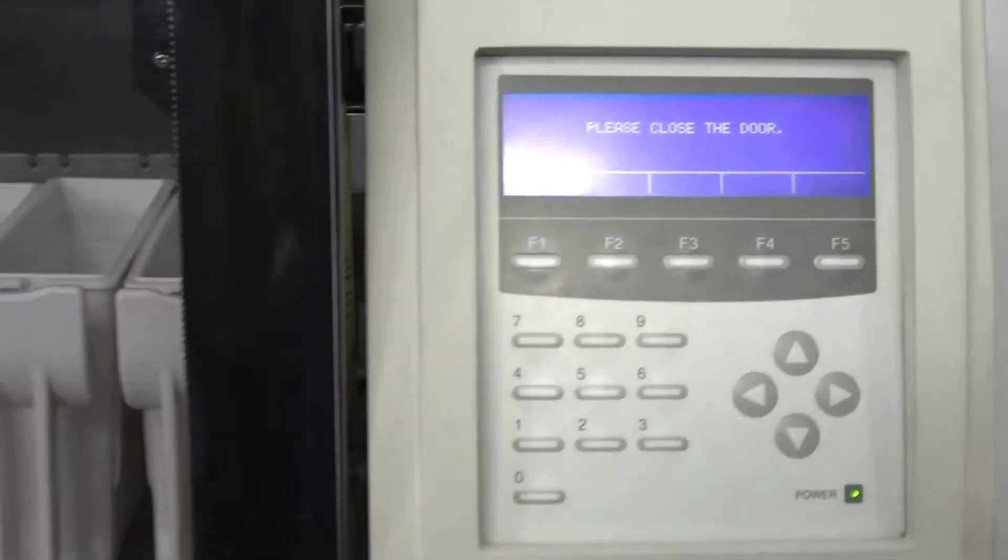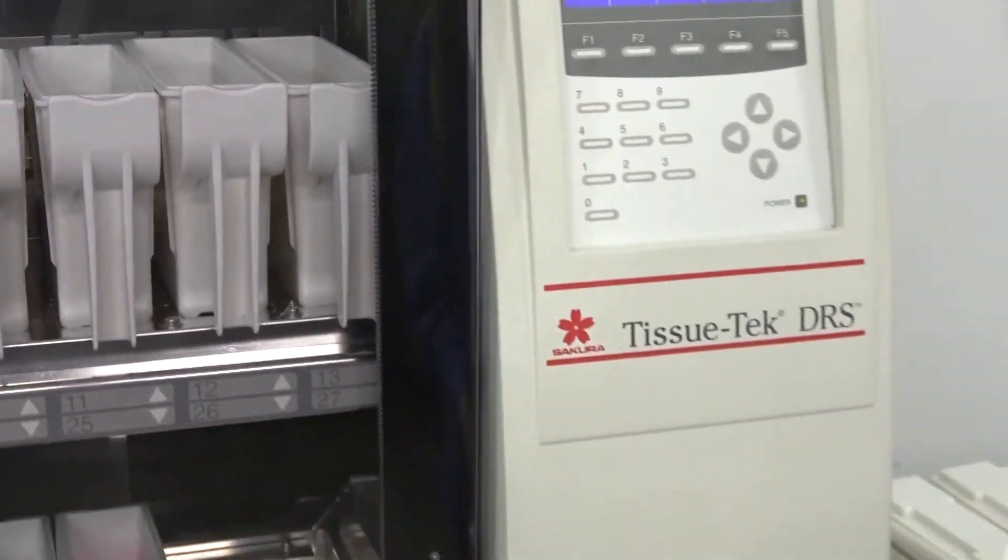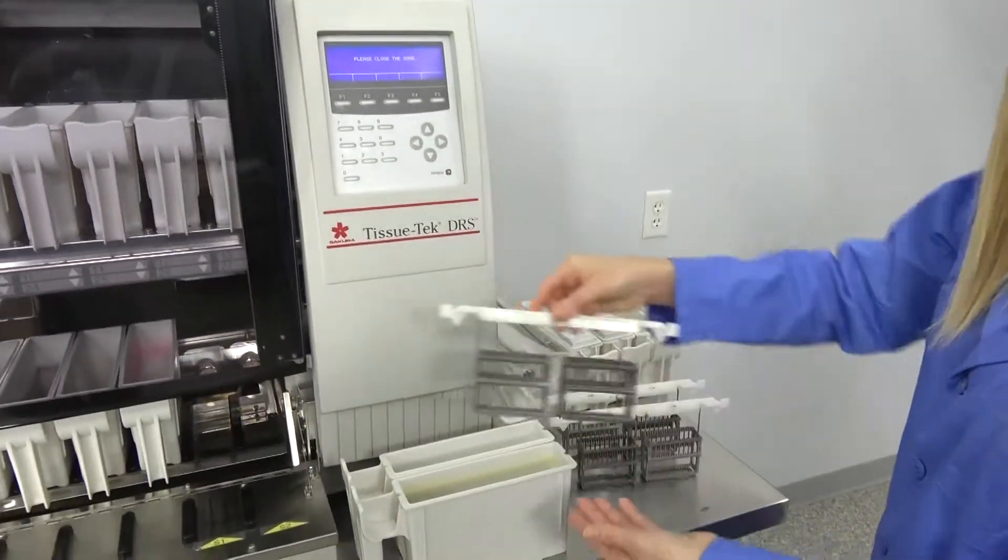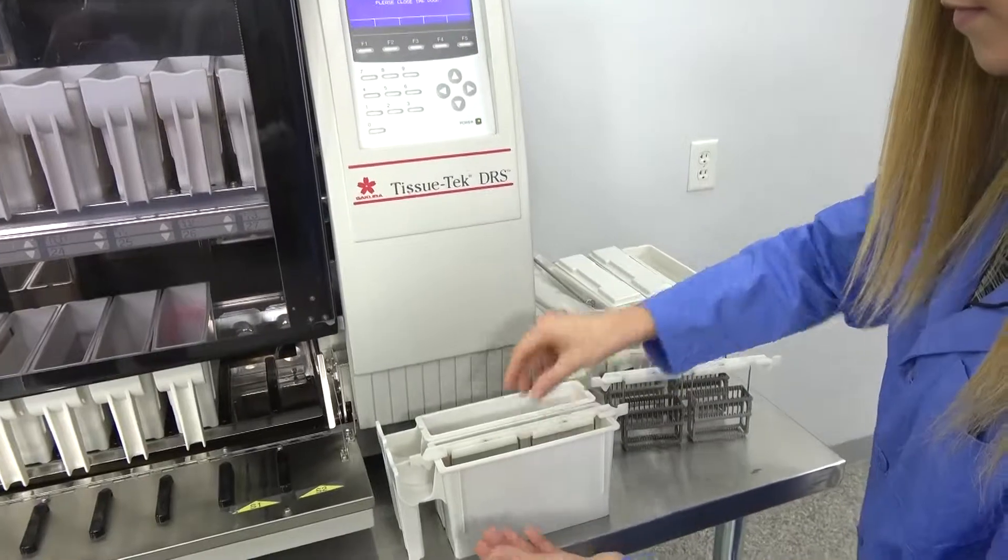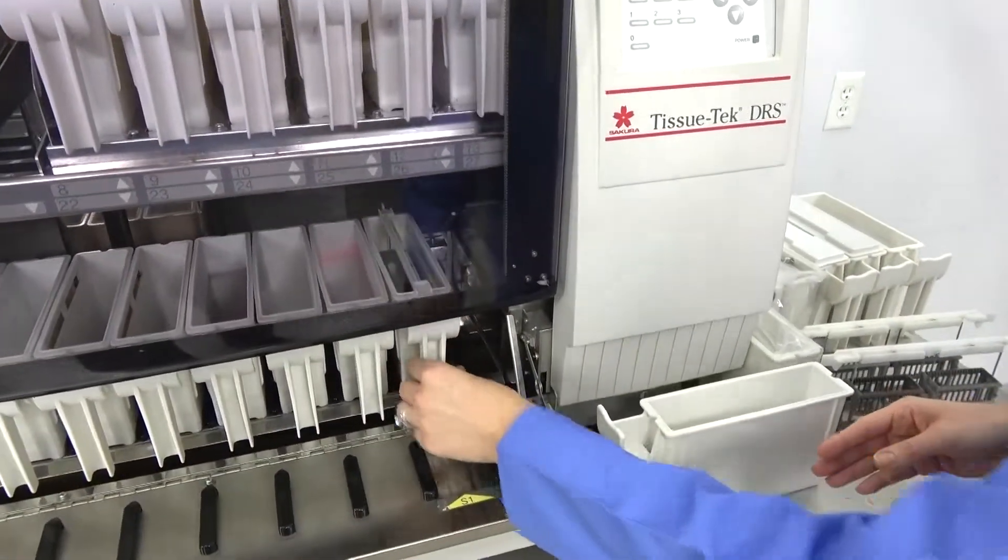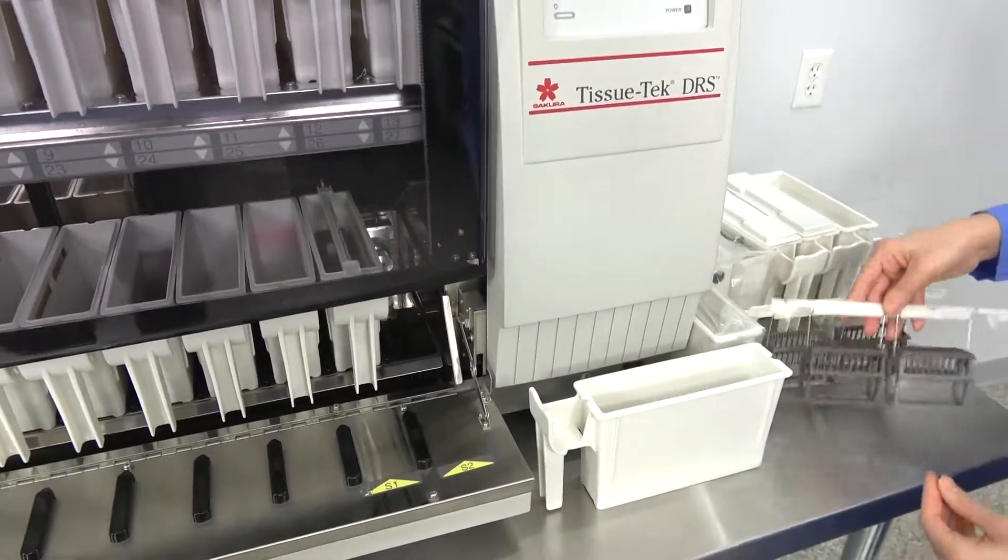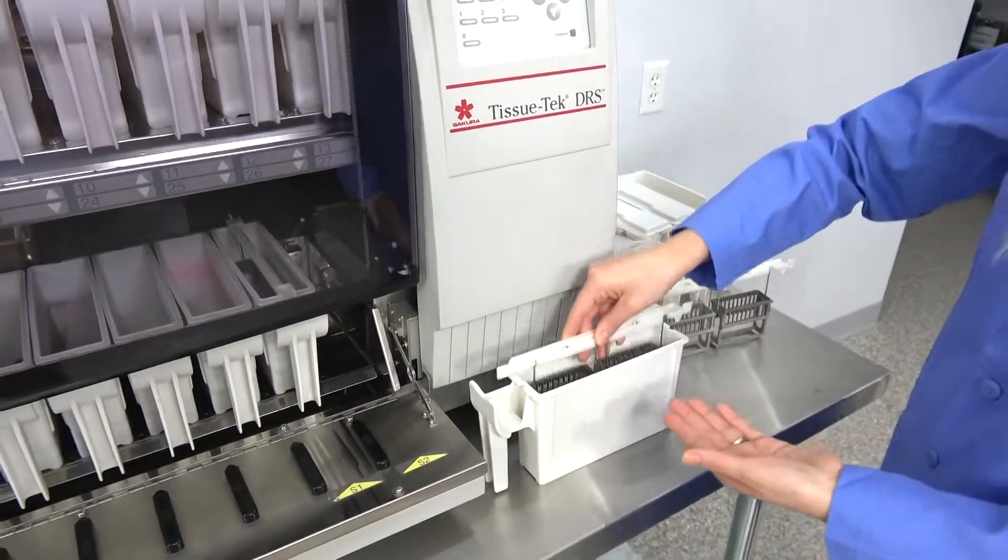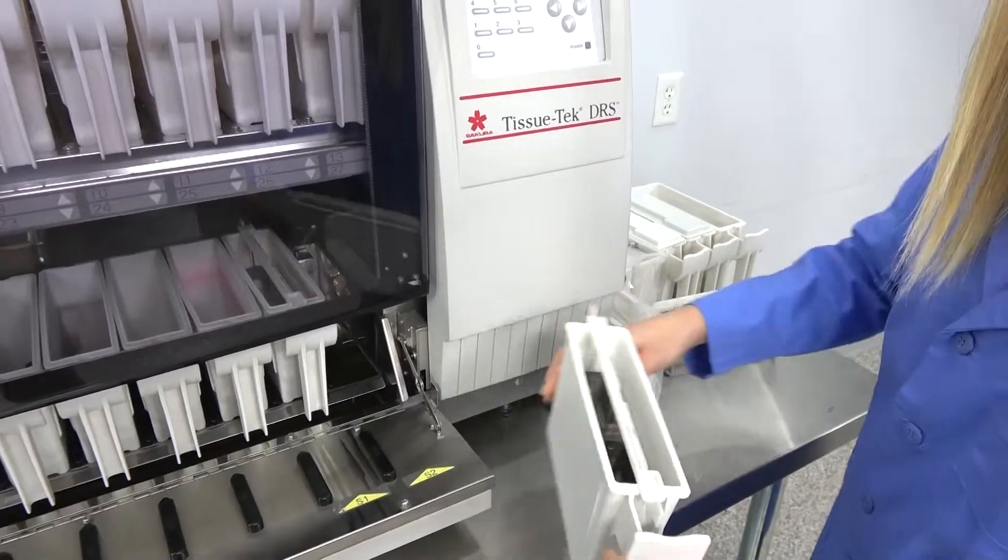So we're going to start that and here you can see the slide baskets. We are going to put that in our S1 location. And then I'm also going to insert the S2 location now so I can close the door and we'll start the run.